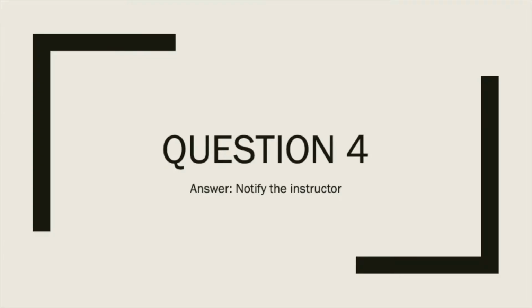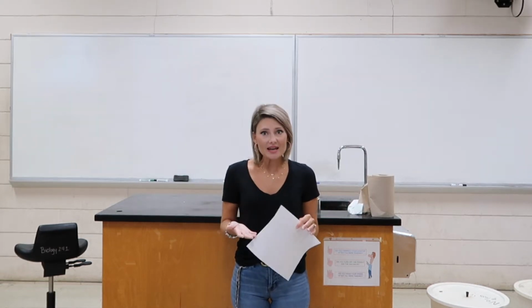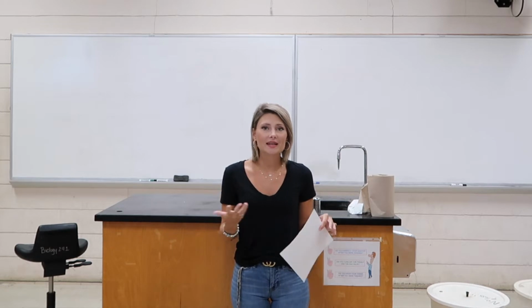Number 4, what should you do if you spill or break a bacterial culture? You're going to need to notify the instructor. You are going to be dealing with live bacterial cultures in this class. Pretty much every day, they're in glass test tubes. Eventually throughout the semester, somebody is probably going to break one. So if that happens, or you spill one, you need to notify the instructor so that we can properly clean it up with disinfectant. We don't want you accidentally getting contaminated with E. coli or staph or something like that. So you need to notify me for that one.